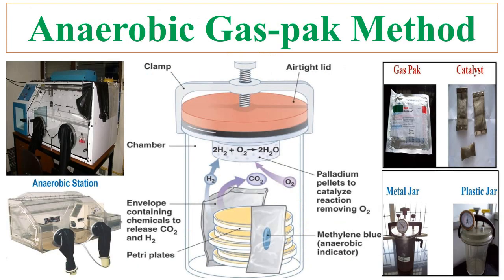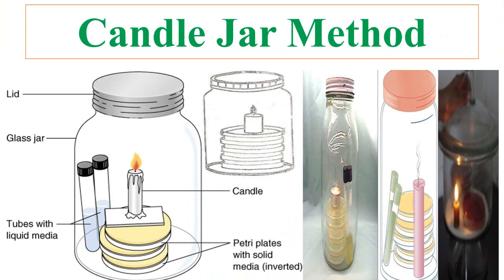This slide shows the anaerobic Gas-pak method, which uses a Gas-pak inside a metal or plastic jar in an anaerobic station. While this slide shows the candle jar method, which uses a candle inside a glass jar.